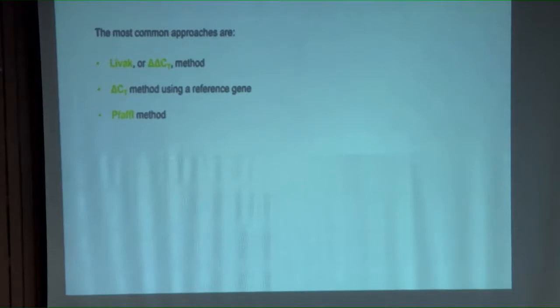Remember, in the literature you will find that the Livak or double delta CT method is the most popular method. We also have the delta CT method using a reference gene, and the Pfaffl method. For these three methods, I think we have exclusive lectures that will feed you more on this.